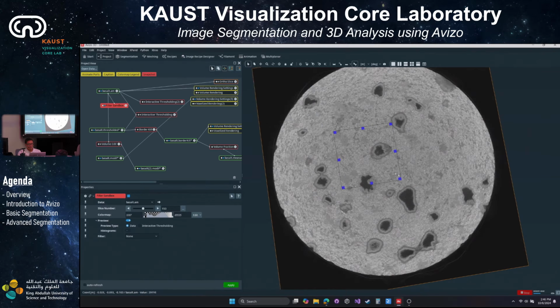Yeah, so filter sandbox, you have to like put the box where you want to show the preview. So I can try a bunch of filters, right? And it will modify the image, right? My goal here is to apply a filter such that if I apply a threshold to the data, it's easier to get the minerals out.